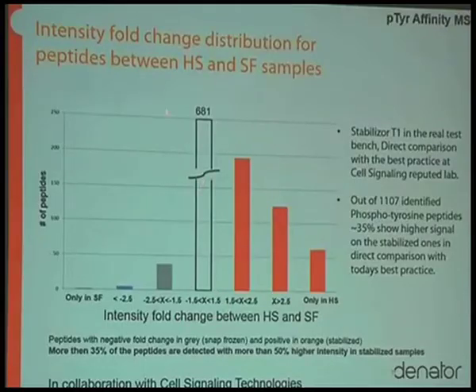So it's also important to note that roughly 2/3 did not change. So a lot of phosphorylation doesn't change. So if you're lucky and you're only looking at 1 or 2 phosphorylations, you may be looking at a stable phosphorylation. That's good for you. But you don't know until you've done the experiment. The time course experiment will tell you whether or not your phosphorylation is stable.